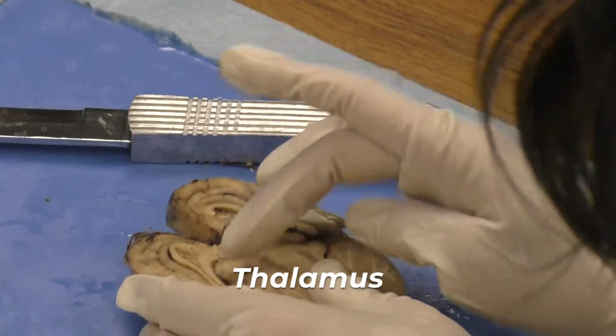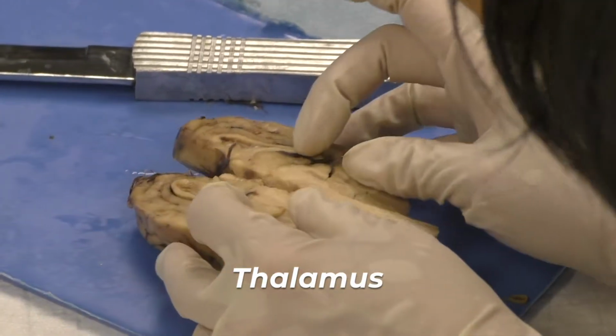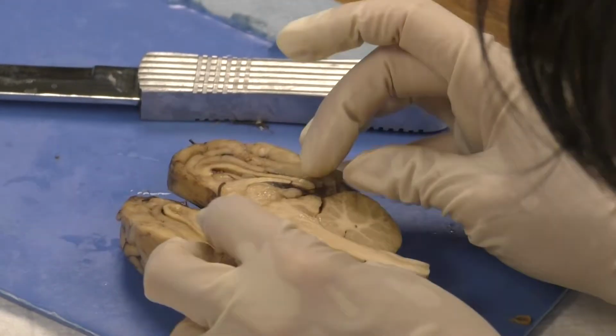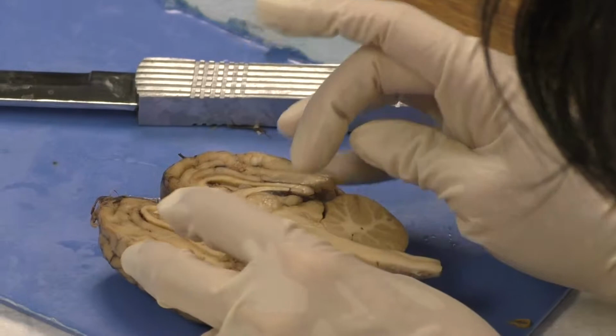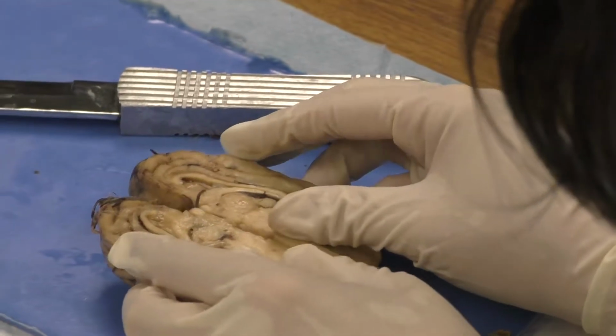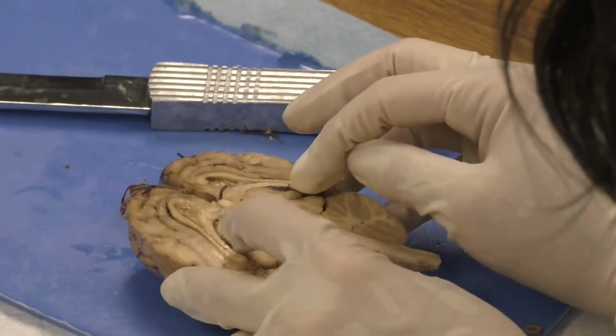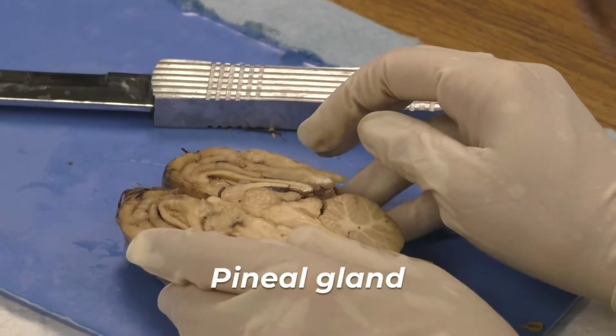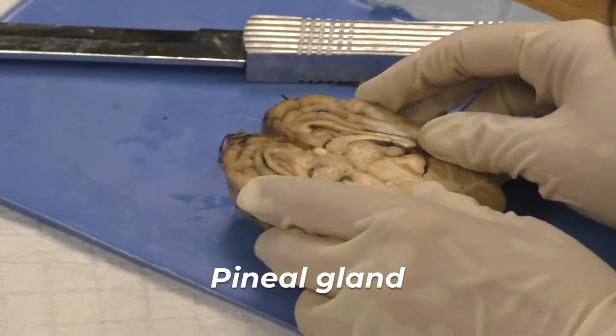Right and left, and then there's a little ball up here, kind of hanging off the back end of the thalamus. Anybody know what that is? There's the thalamic ball, and then there's this littler ball. That's the pineal gland. Ooh, very good.